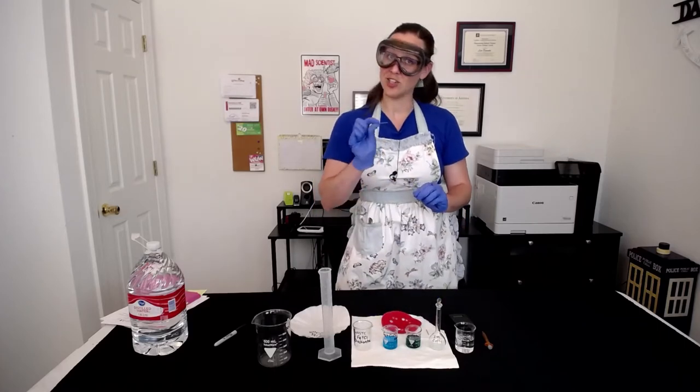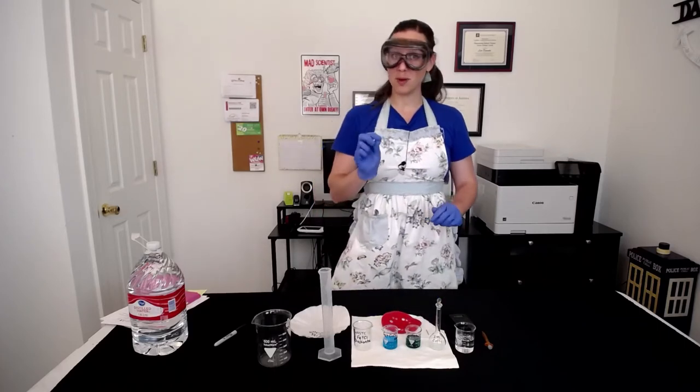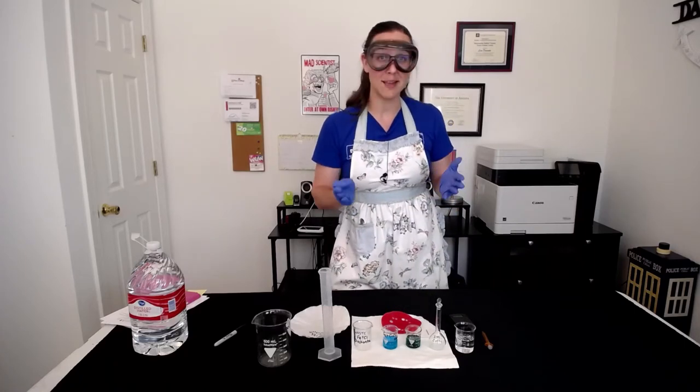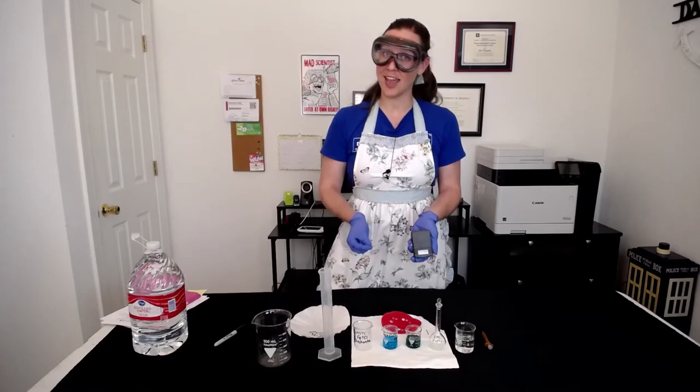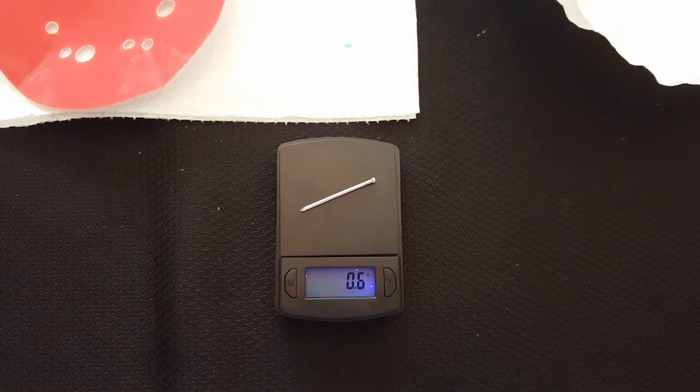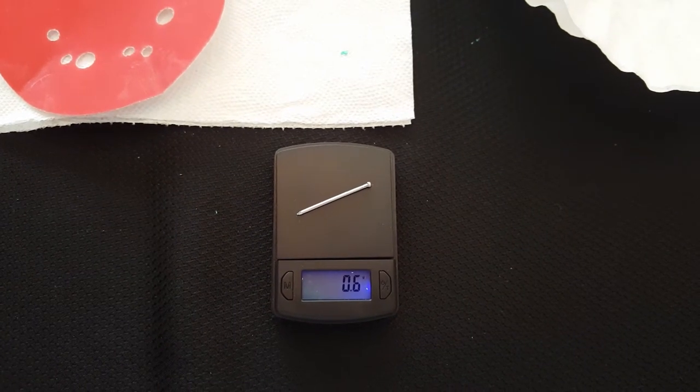Now that's a good looking nail right there. Before we put this iron nail into our copper chloride solution, we need to find the initial mass of the nail. So go ahead and put your nail on a scale and figure out what its initial mass is. A whopping 0.6 grams.